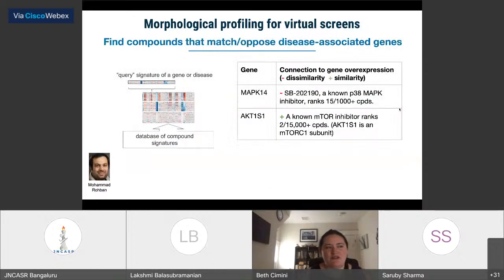We're also hoping now to be able to query experiments against one another. So now that we've done some cell painting experiments where we've looked at drugs and some where we've looked at genes, can we take the features that we measured in one experiment and look at all the compounds and see how the compounds are similar to all the genes?